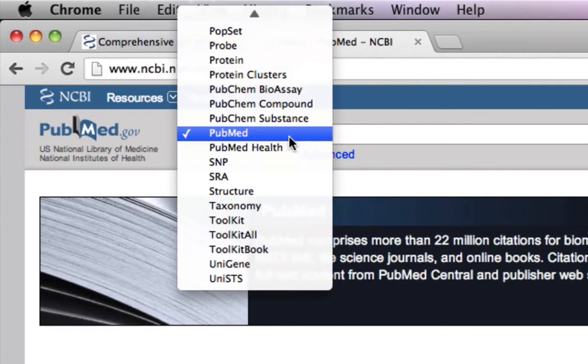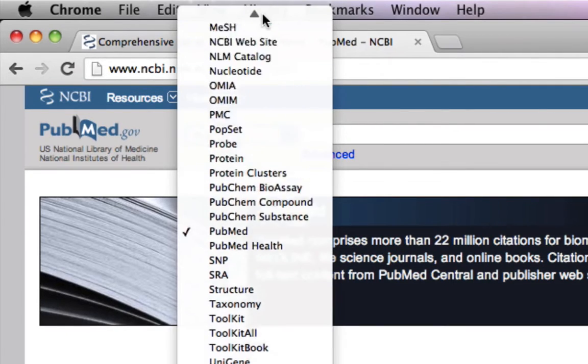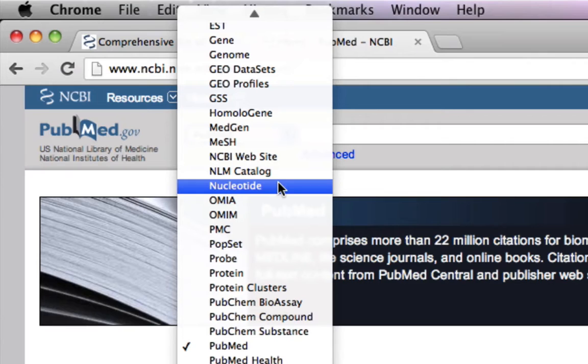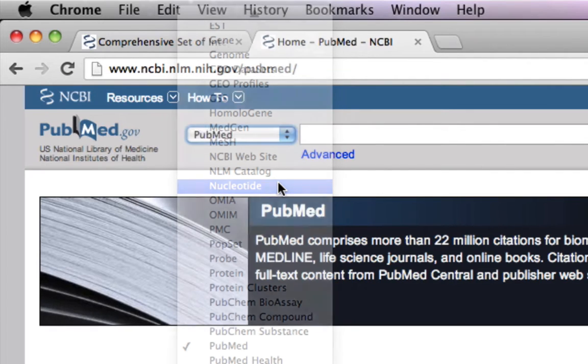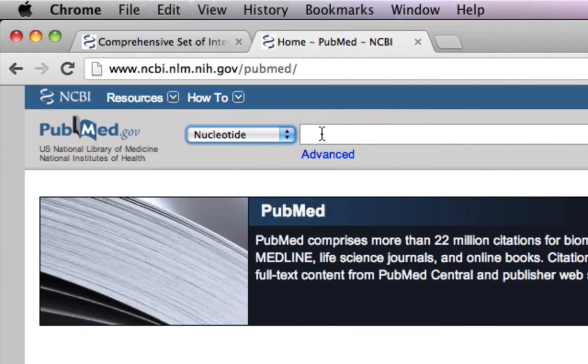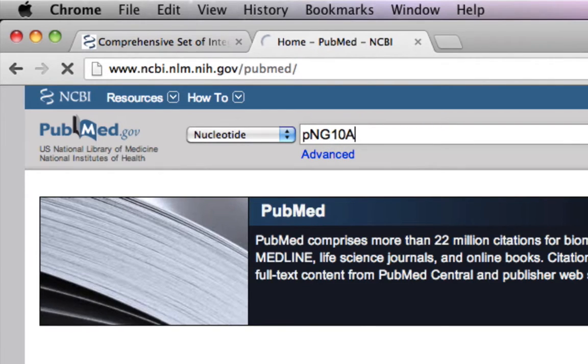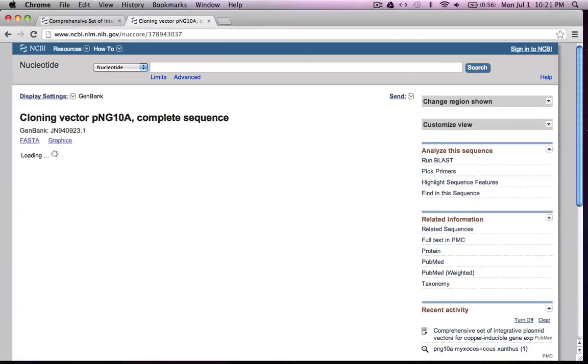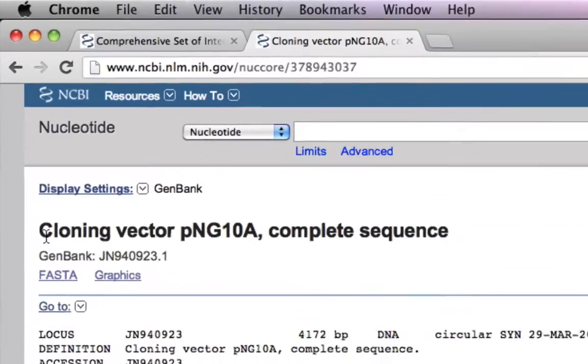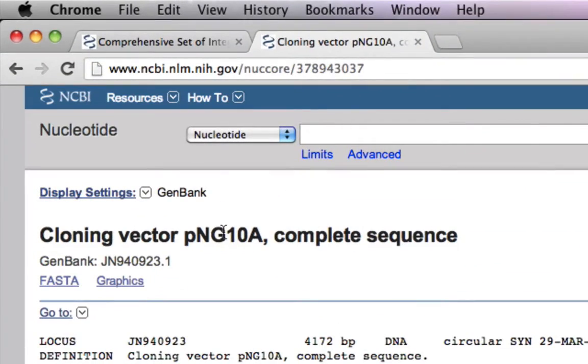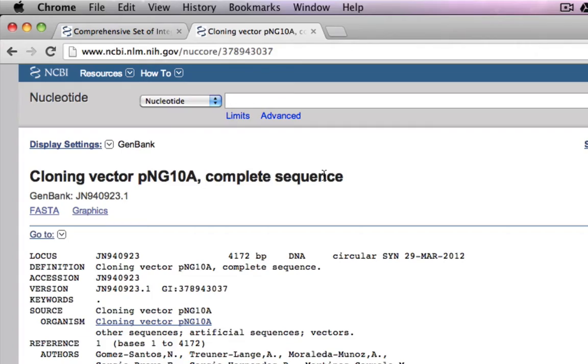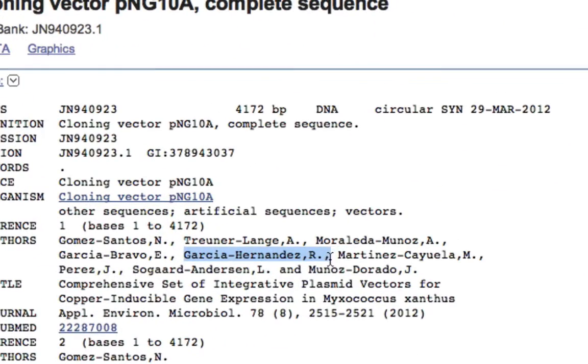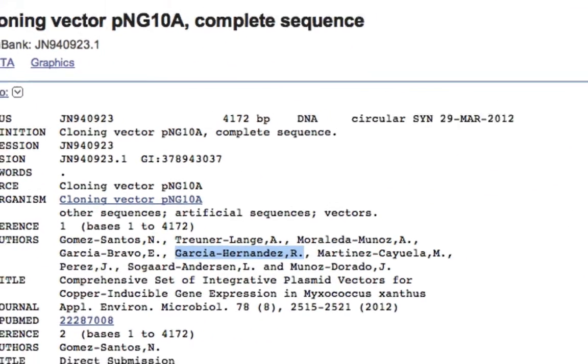You go to the nucleotide section and type in PNG10A. Most likely the authors of this paper must have deposited the sequence, and here you go. This is a cloning vector PNG10A complete sequence, and these are our authors who published the paper.